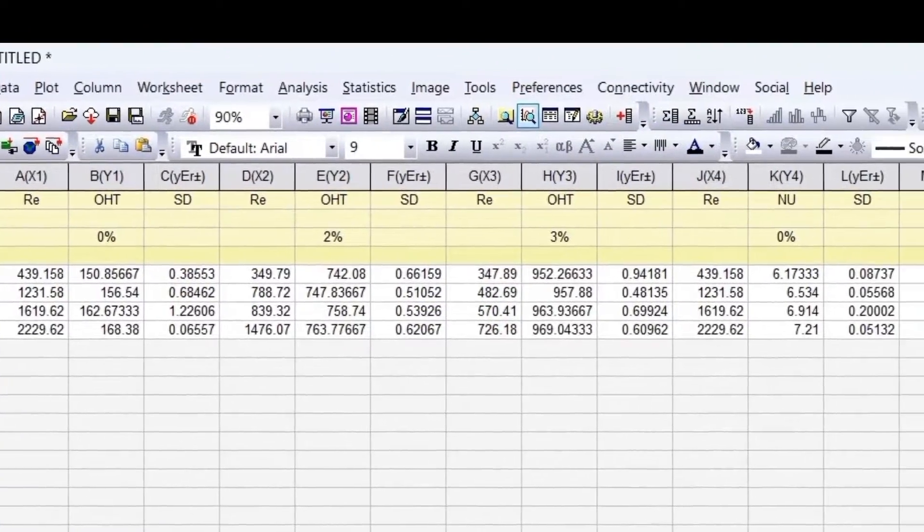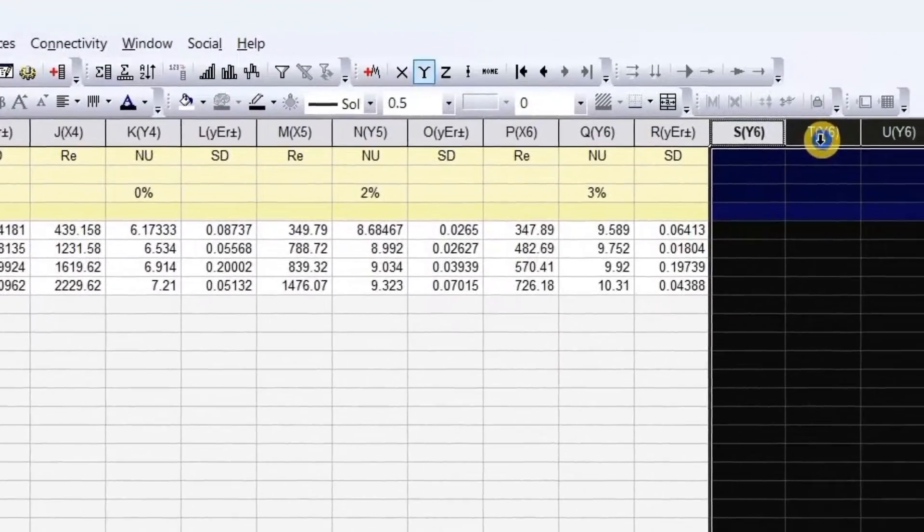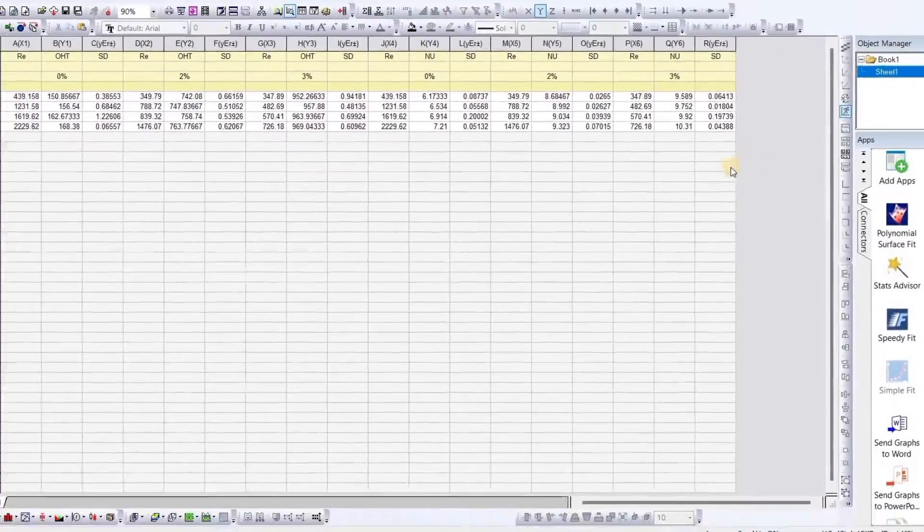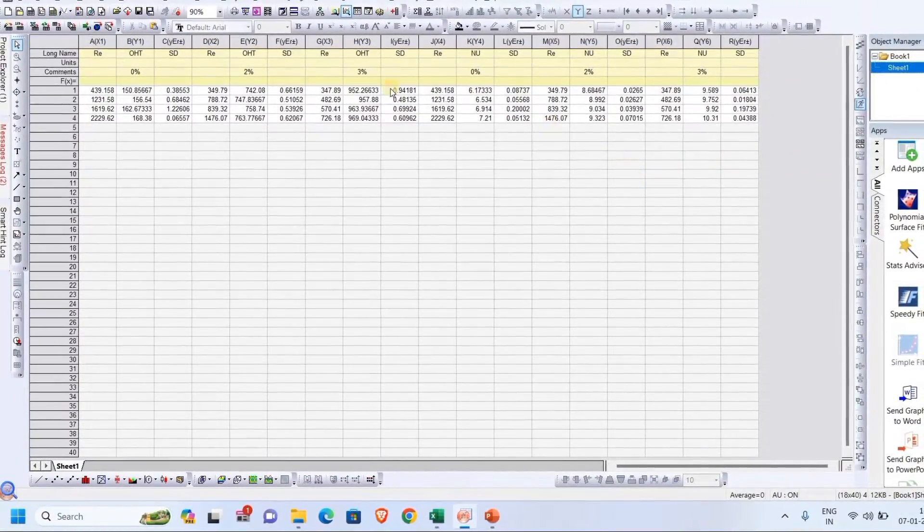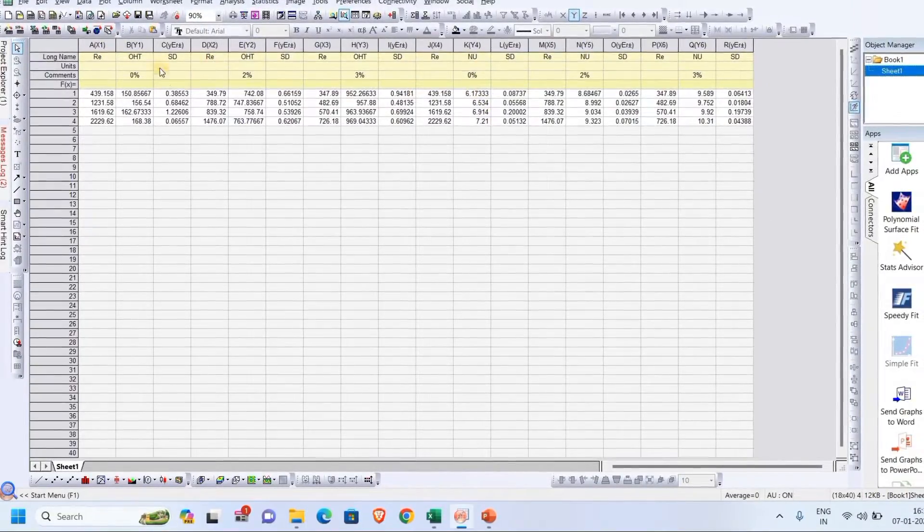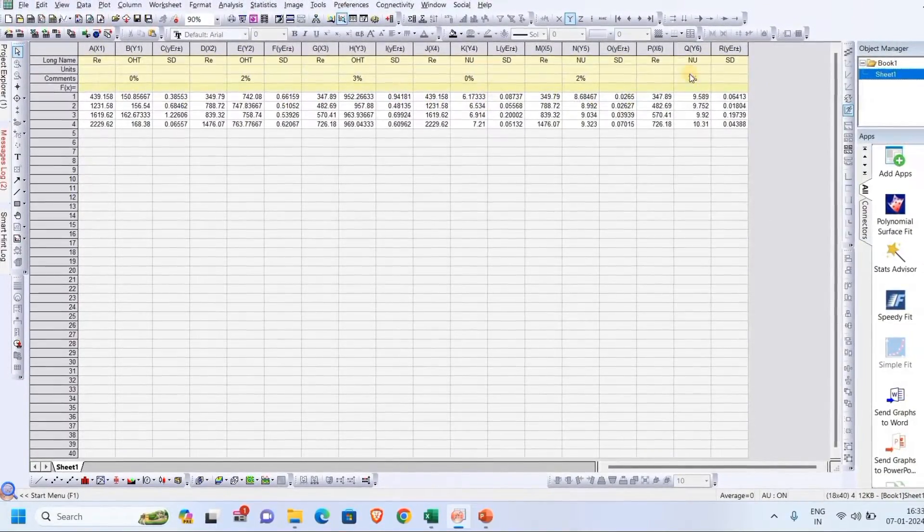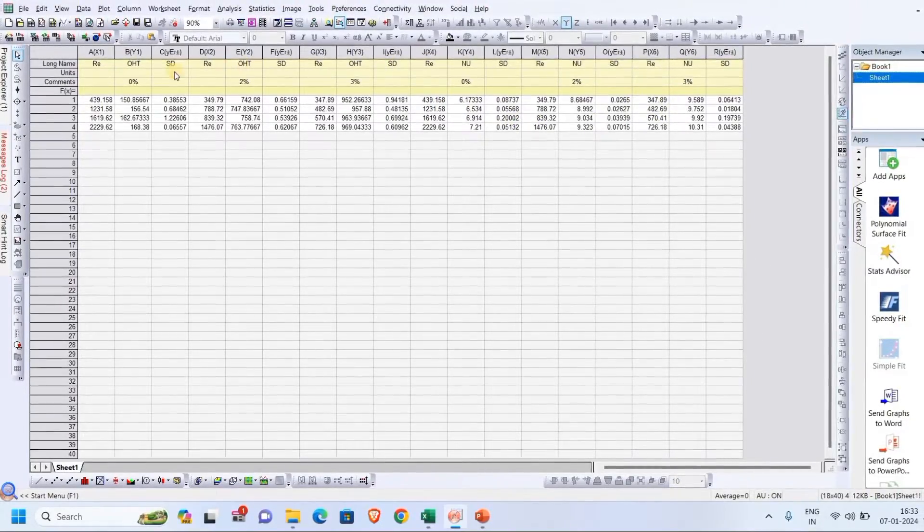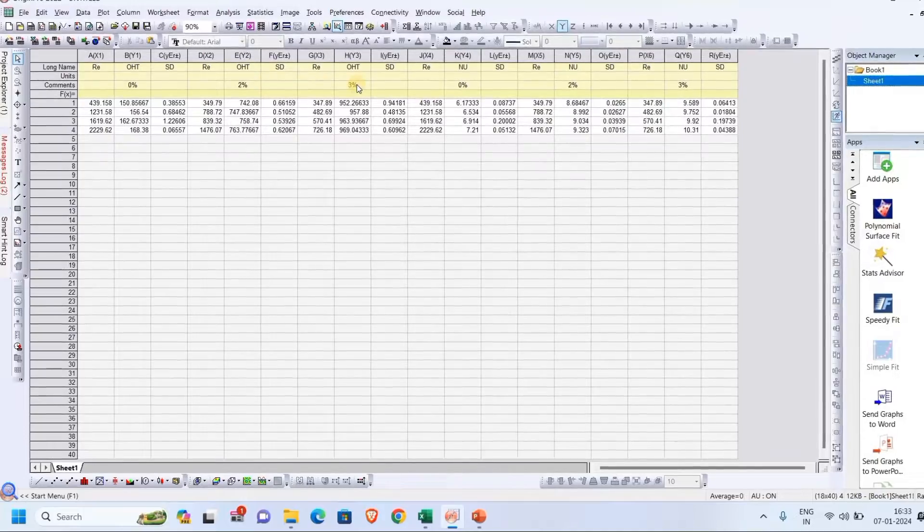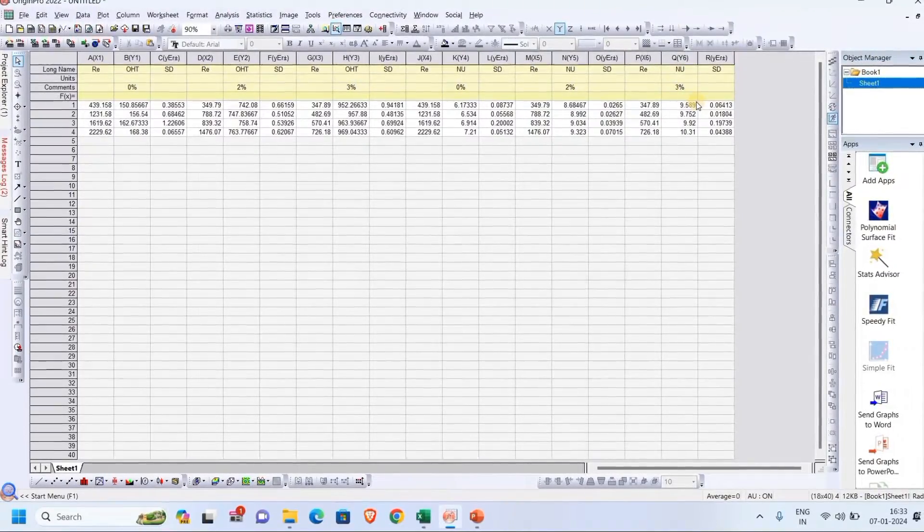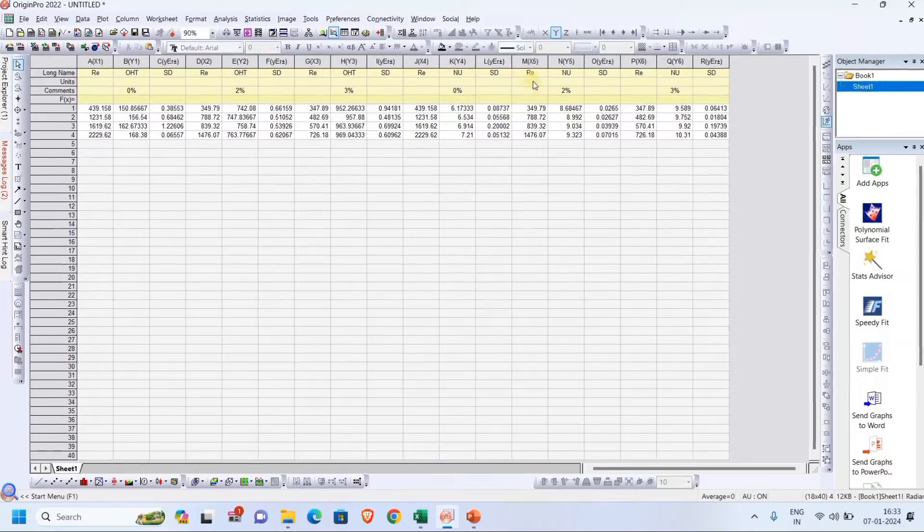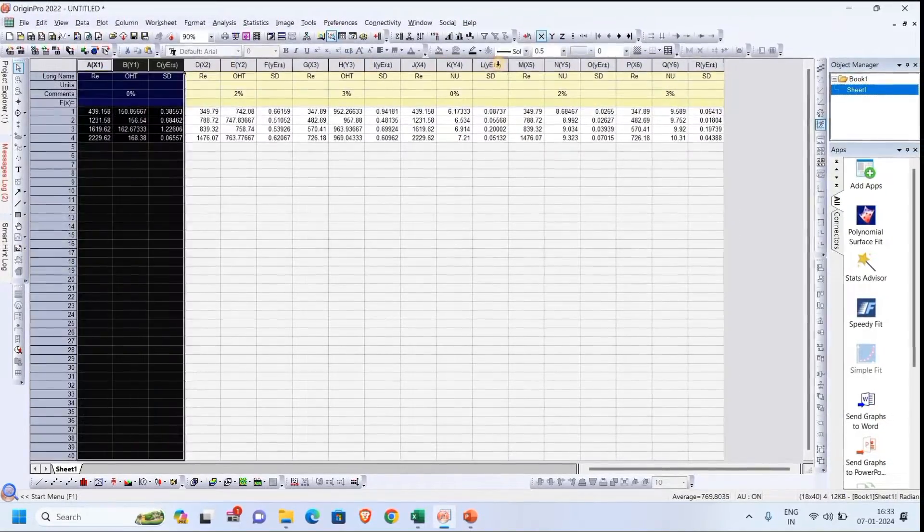So here, this part represents the OHT part, and this part represents the Nu part, for three corresponding concentrations: 0%, 2%, and 3%. Now we will plot this one in the y1 graph and this one will go to the y2 graph.